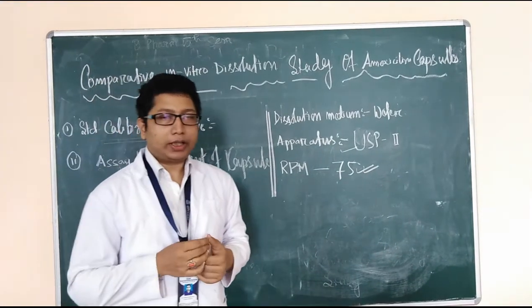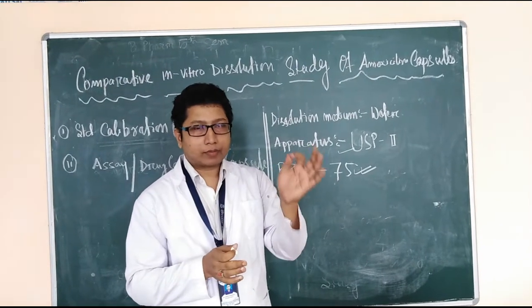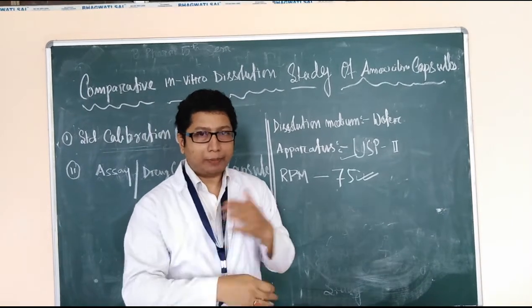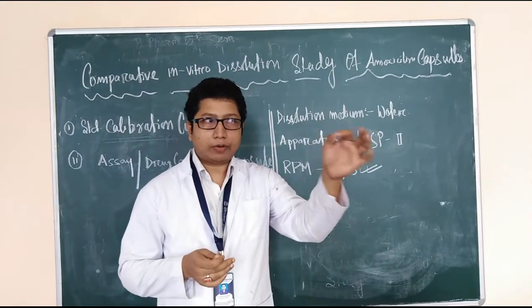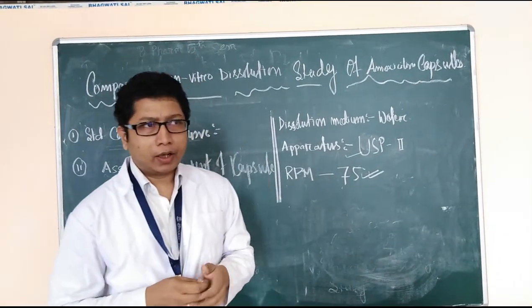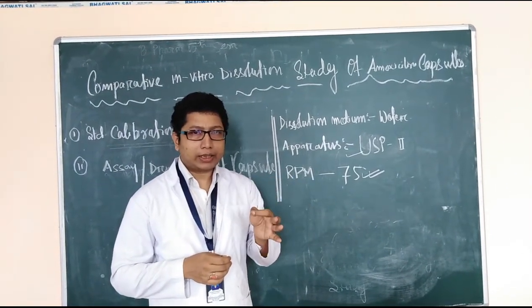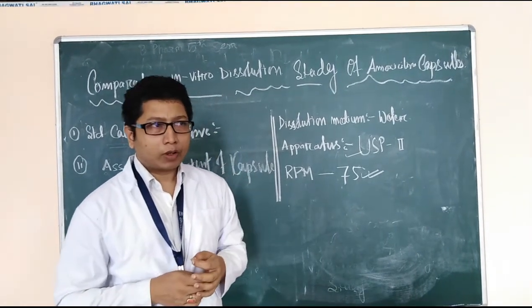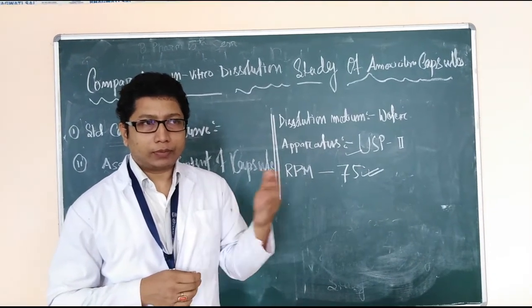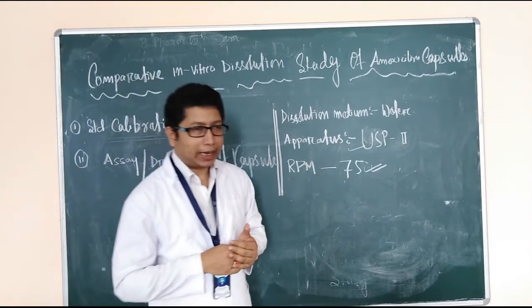During the entire period of study, we have to follow sink conditions, which means that when we collect a sample, at the same time we have to replace that same amount with fresh media. In this way, we will perform the study. Once the dissolution study is complete, the samples collected at each interval will be suitably filtered, and then after suitable dilution we will go for determination by UV visible spectrophotometer analysis.